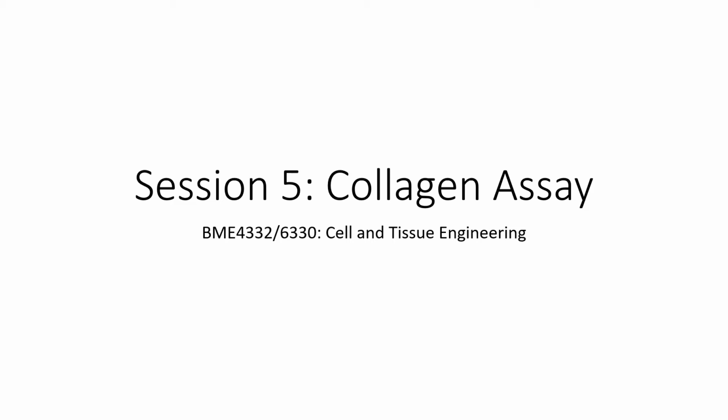Hello everybody, welcome to session 5 of our lab video series. This lab session 5 focuses on collagen assay. This is for the course Cell and Tissue Engineering.